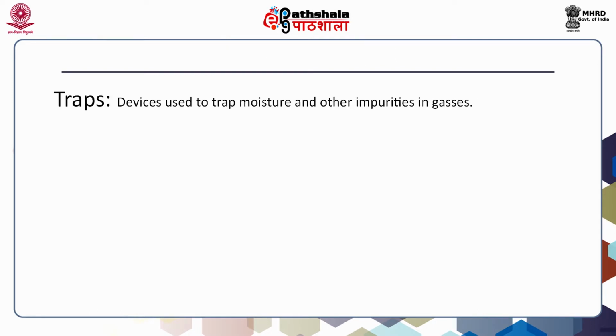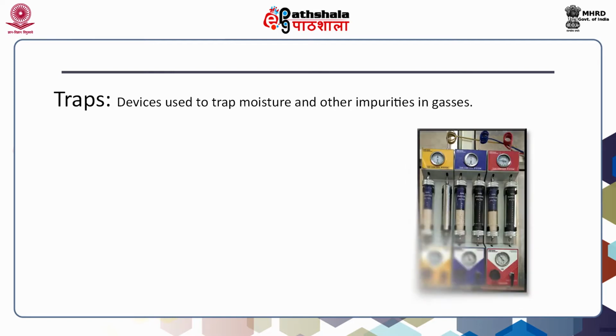Now, we are using the traps. Here I am discussing various traps which are used in gas liquid chromatography. Since we are using gases in gas liquid chromatography, the general requirement or principle is that these gases should be very pure or highly pure in nature. Though the companies from where we procure these gases take care of these things, now the facilities and instrumentation are available where we can be doubly assured.